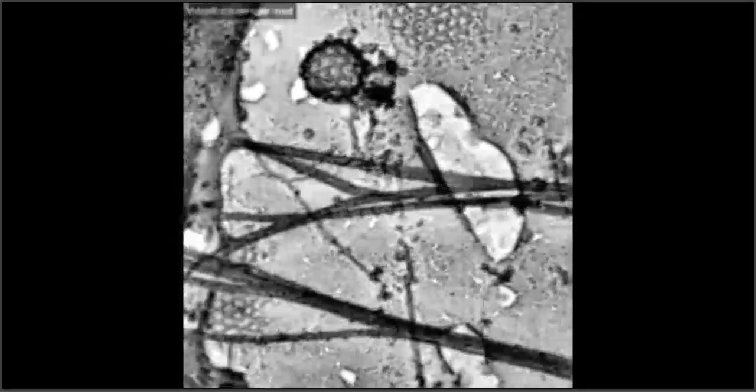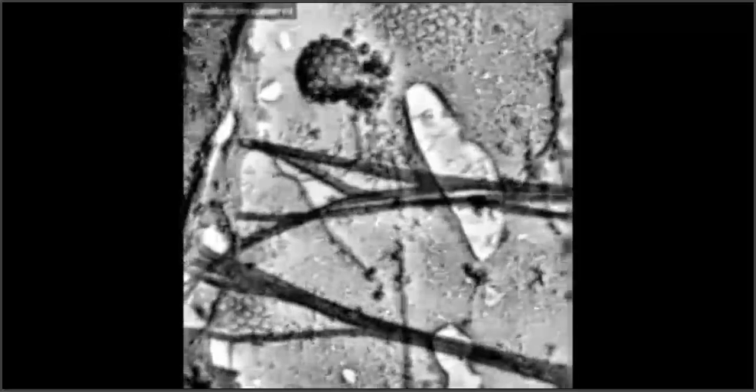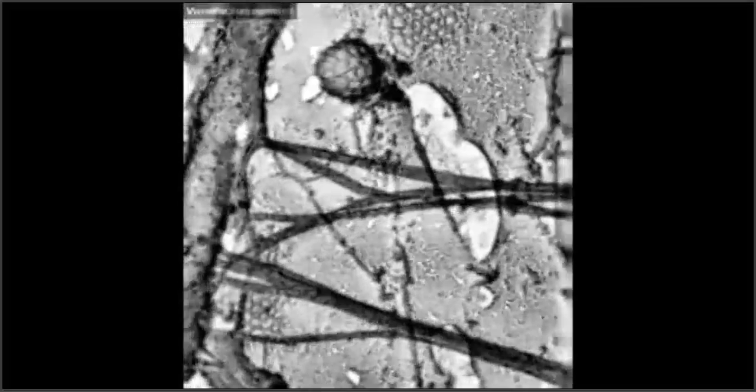In addition, you'll see a whole bunch of black dots next to it. That's an actin and actomyosin complex that's there to help bud or pinch that bud off from the plasma membrane. And you can actually see little tiny dark spots off these large strands, which are the microtubules. Those are motor proteins staged there to capture that clathrin-budded vesicle to bring it to wherever it's got to go in the cell.